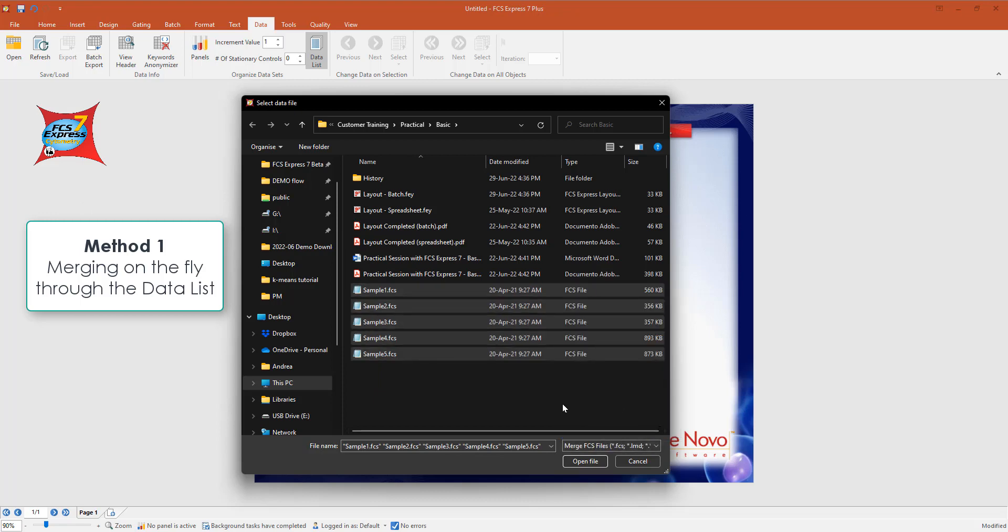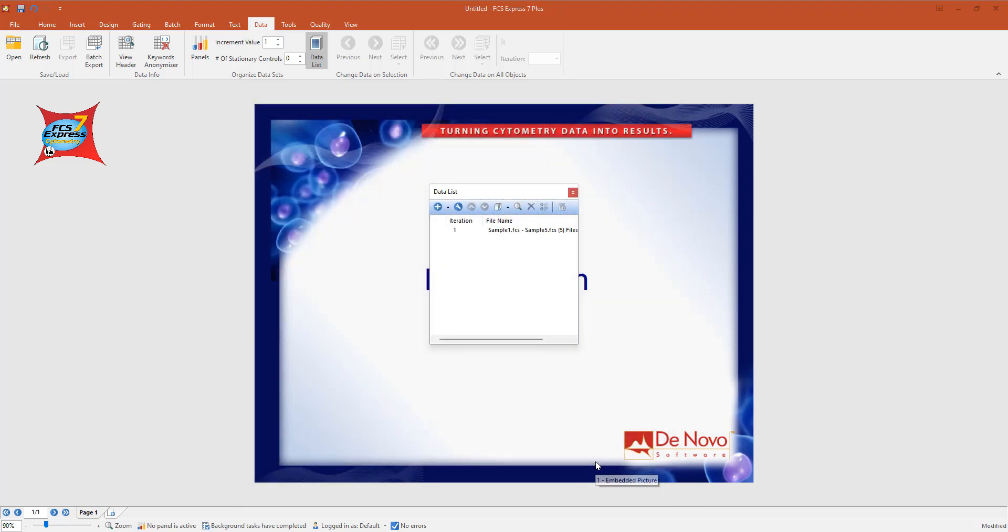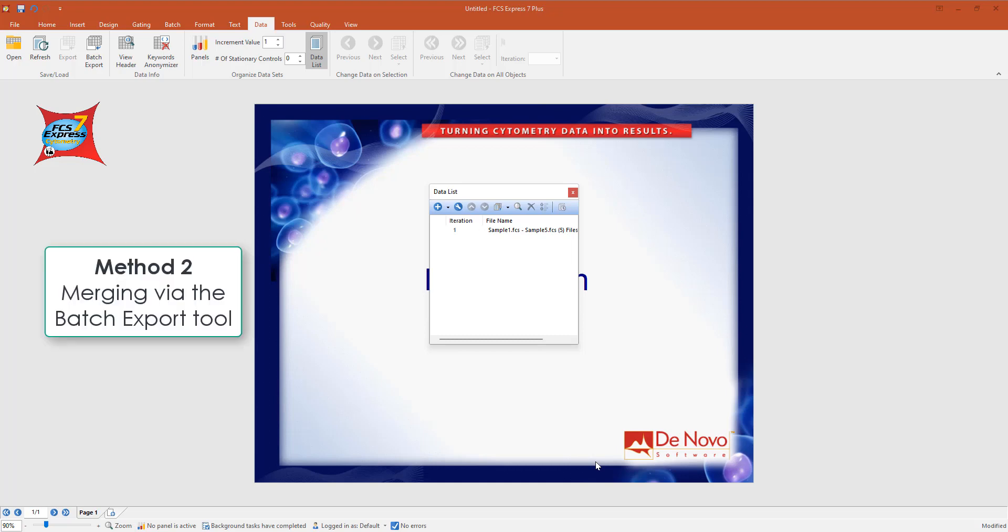It's a very quick and easy way to merge data all together. Just consider that in this easy way the compensation of the first file will be applied to every other file. If you want to merge files and be more flexible in terms of which compensation to apply and many other options, I suggest the second way of merging data, which is again through the Data tab by using the Batch Export tool. Feel free to refer to the manual or send us an email if you want to go that way.